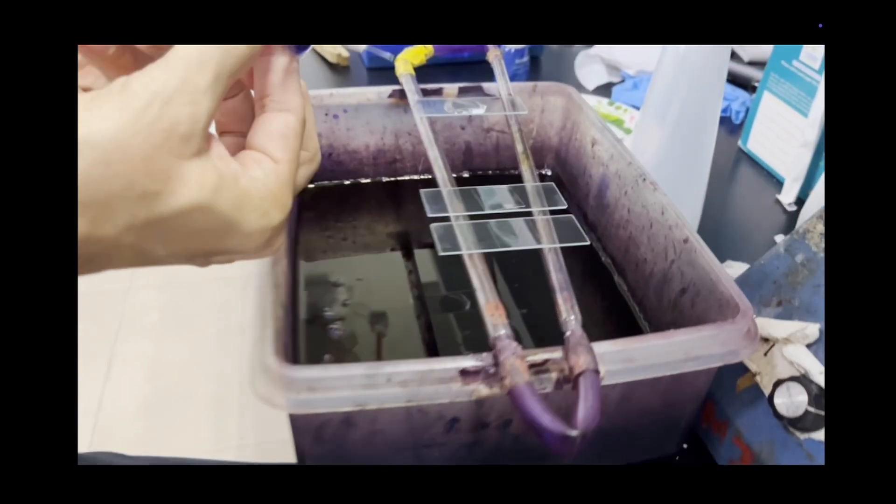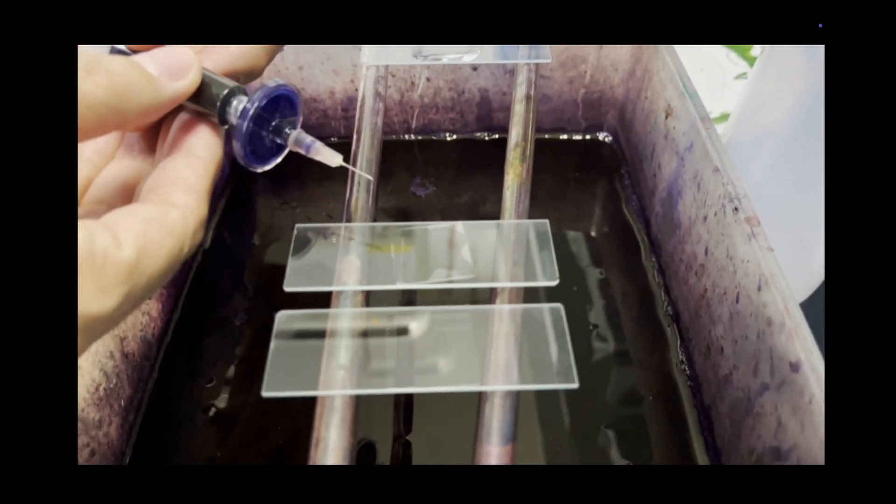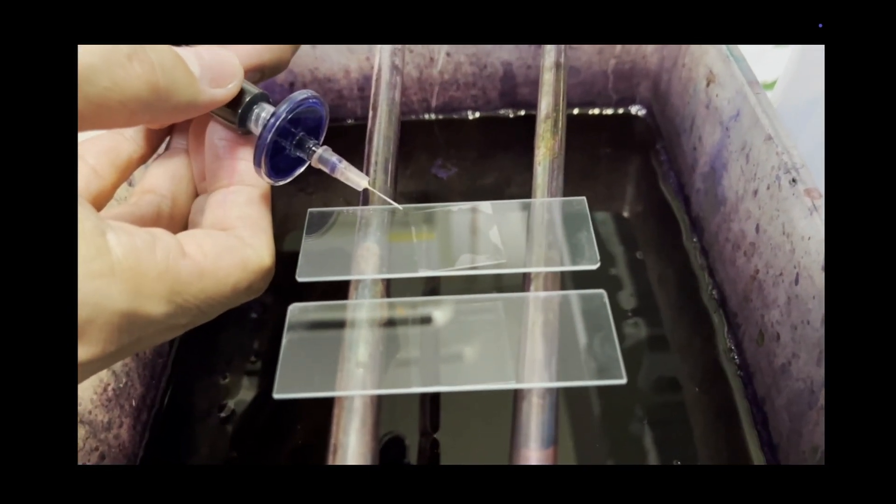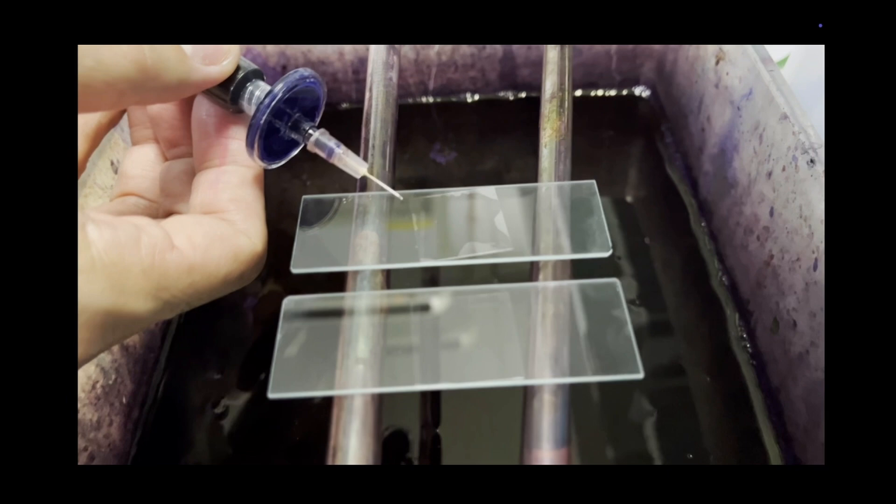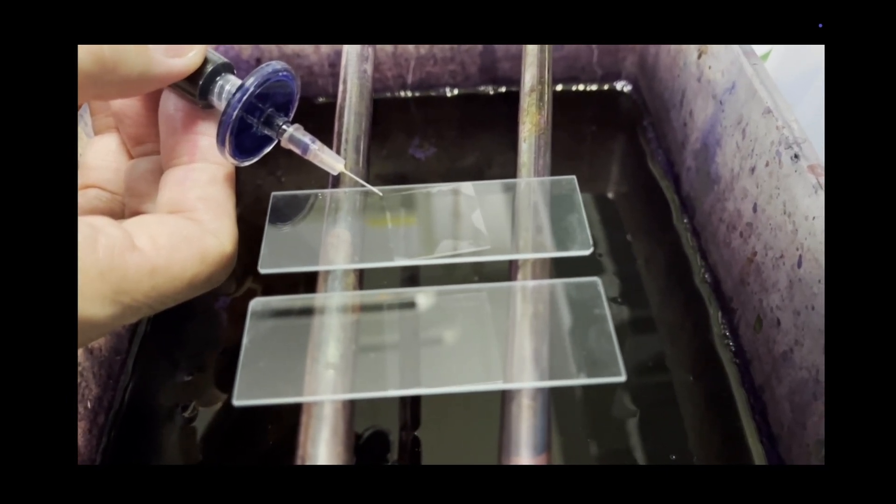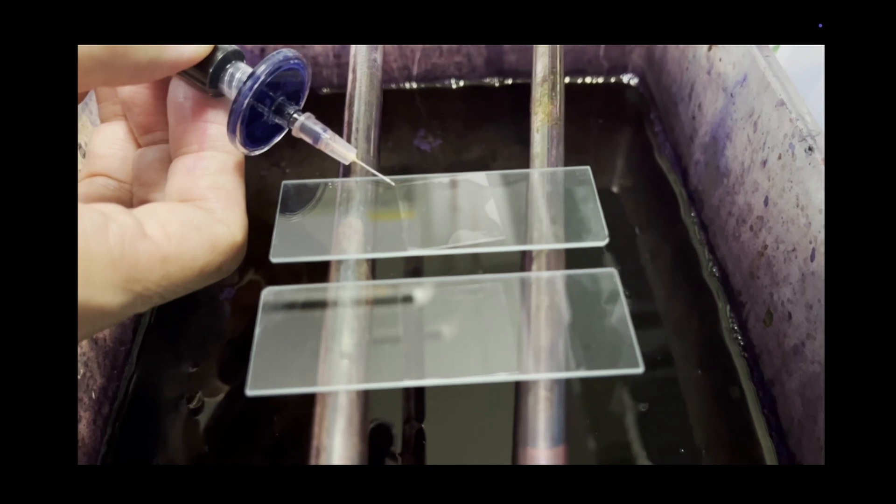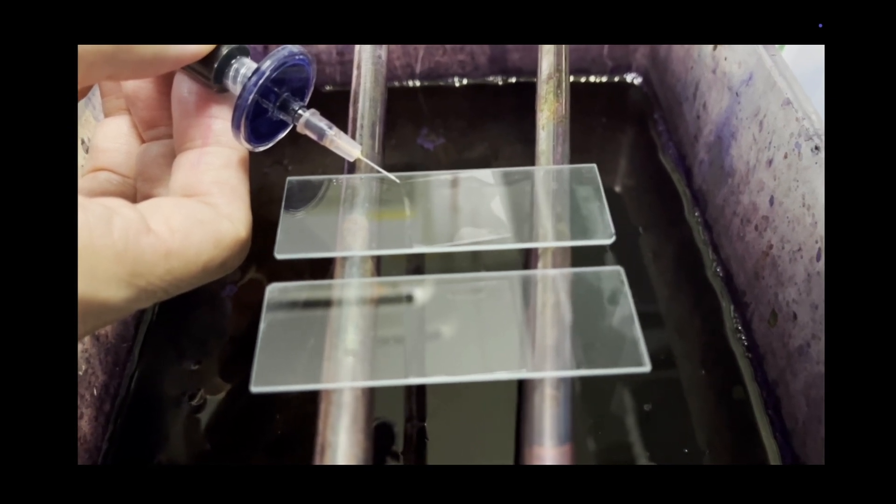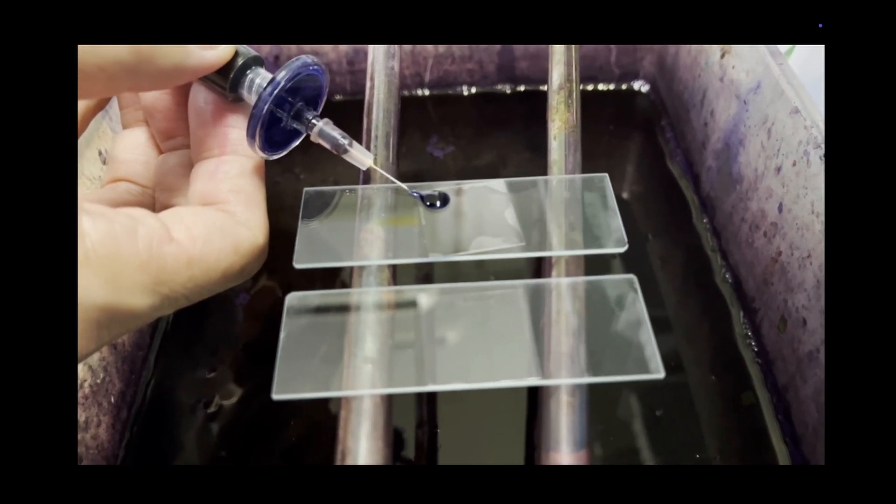Once it is ready after five minutes, we need to put about two drops of the Ryu stain at the edge of the cover slip so that the stain slowly spreads through.